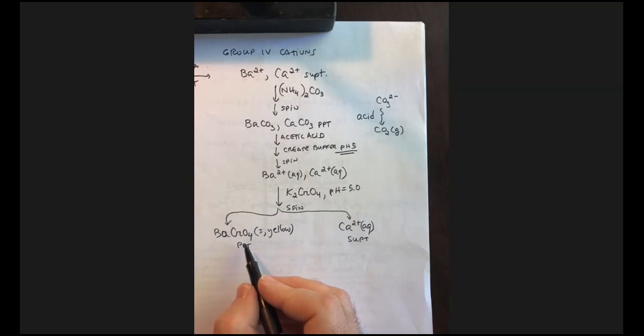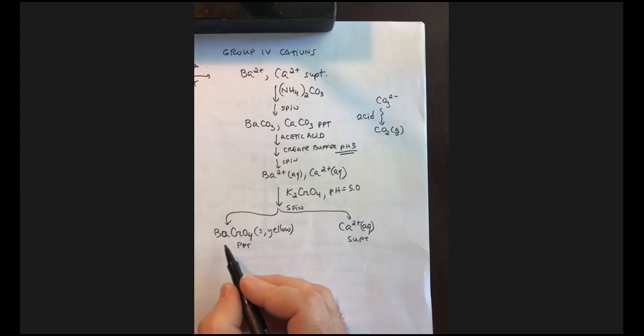As we mentioned in class, some ions have particular colors when you put them to the flame, and barium does that. We usually in our lab, D319, don't have a lot of Bunsen burners available. So we typically don't do the flame tests. So you'll settle for that.